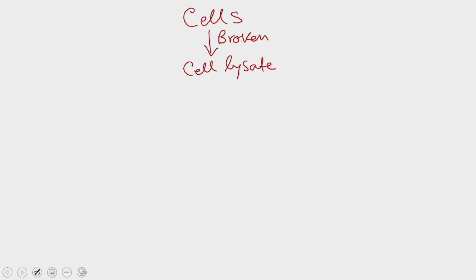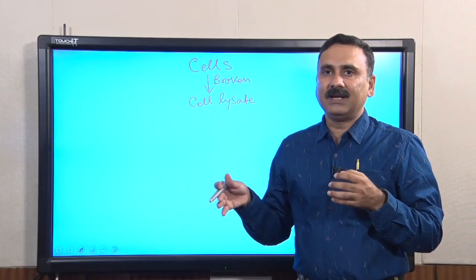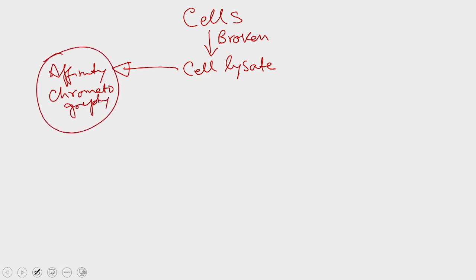Now, depending on the type of purification strategy you are going to use. Suppose the factor I am overexpressing contains a tag, then in that case I will directly use the affinity chromatography. But imagine that I don't have any such thing and I would like to use the conventional chromatography. In that case, what I'll do is, I'll do an ammonium sulfate precipitation.